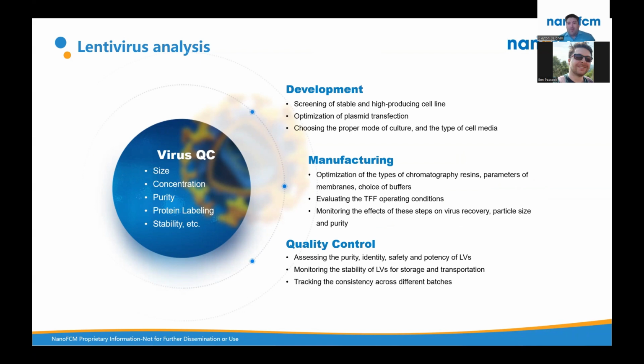We're going to see how purity becomes apparent when we analyze a set of particles and we're able to say this percentage of the particles fall into this category. We're going to talk about the degree of protein labeling between different preps. And we're going to talk about stability and the correlation with some of your other assays.